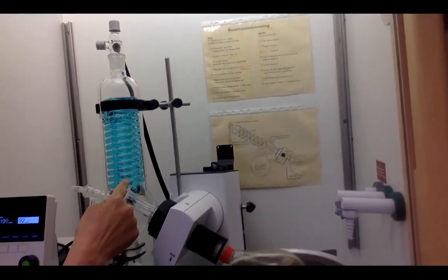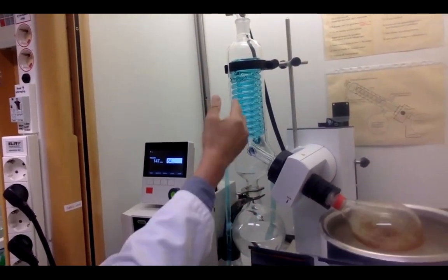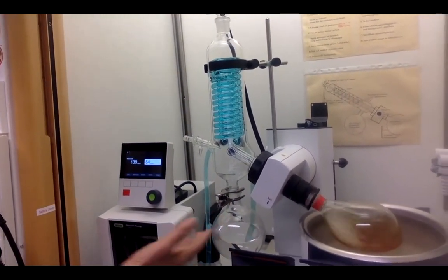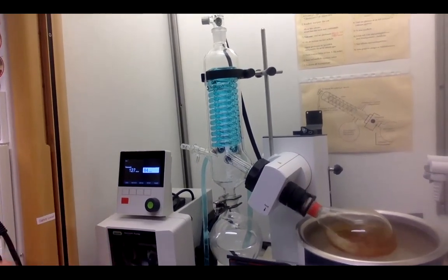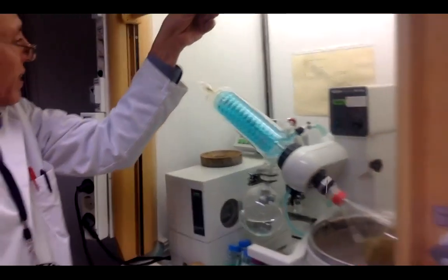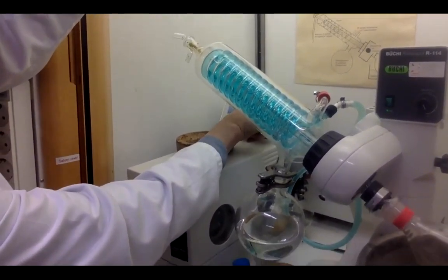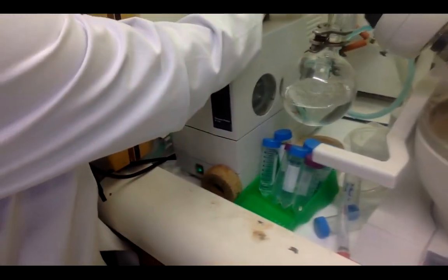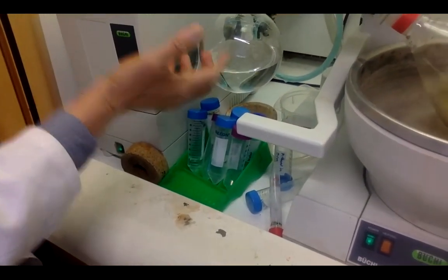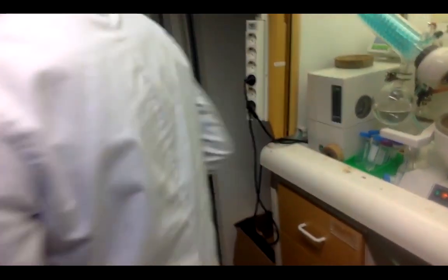This is the rotary evaporator in action — you can see that the solvent evaporates and the condensed solvent collects here. This is a good method for evaporating solvent at temperatures below 100°C — it works for hexane, DCM, methanol, etc. You can see the evaporation happening quickly and the solvent collecting in the flask. Now we finish evaporation when using organic solvents.